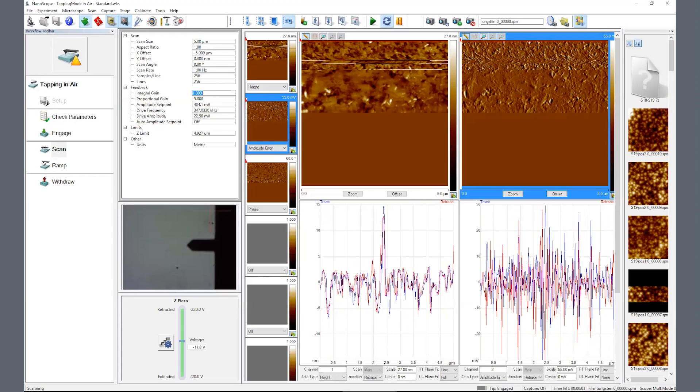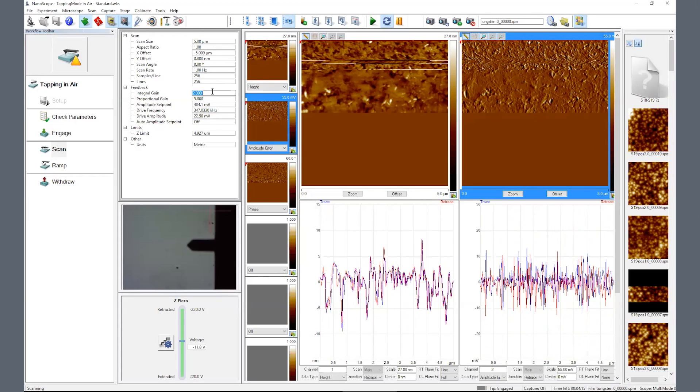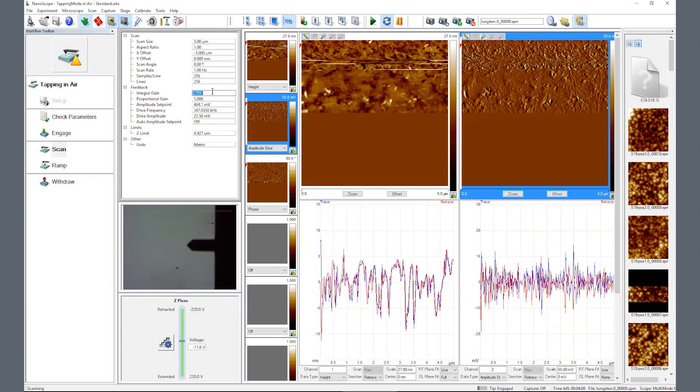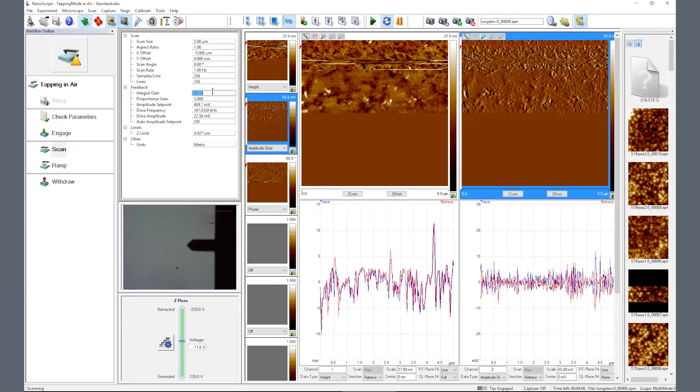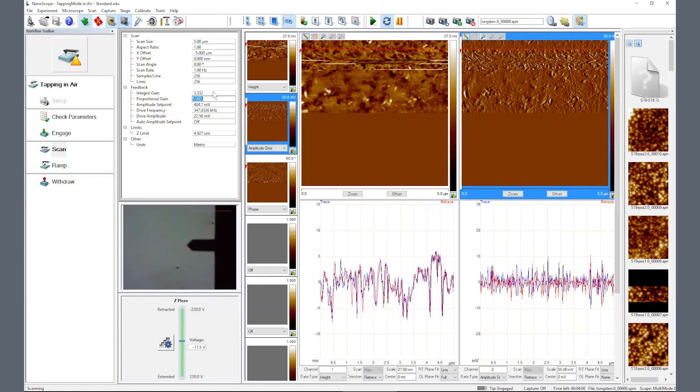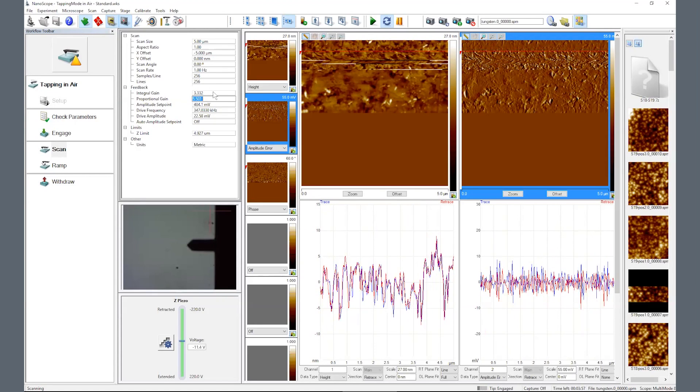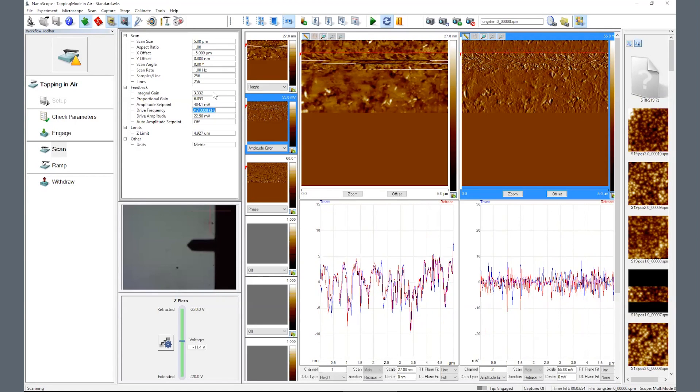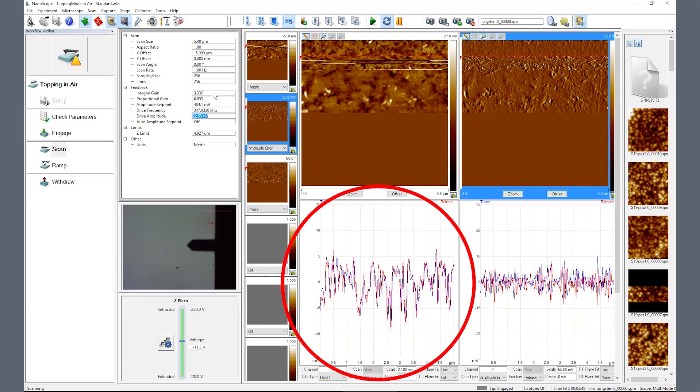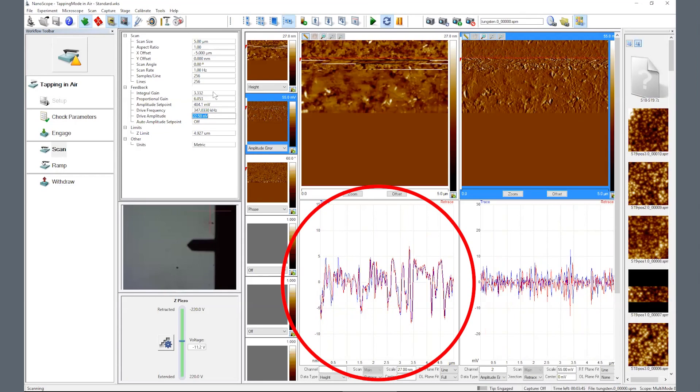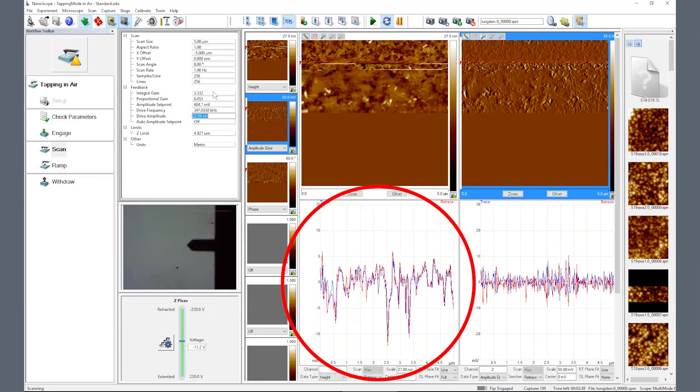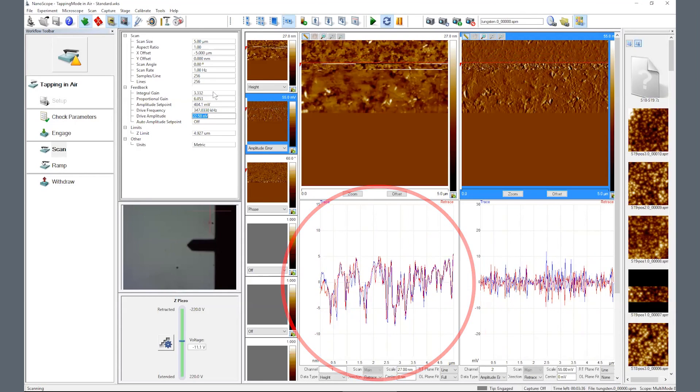Optimize your image resolution by slowly increasing the integral gain using the right arrow on the keyboard or entering a value directly and by increasing the samples per line. Your goal is to see the red and blue trace and retrace curves below the image duplicate each other.